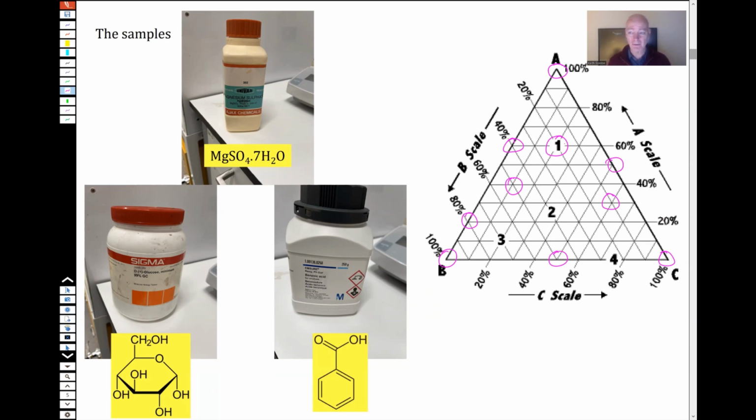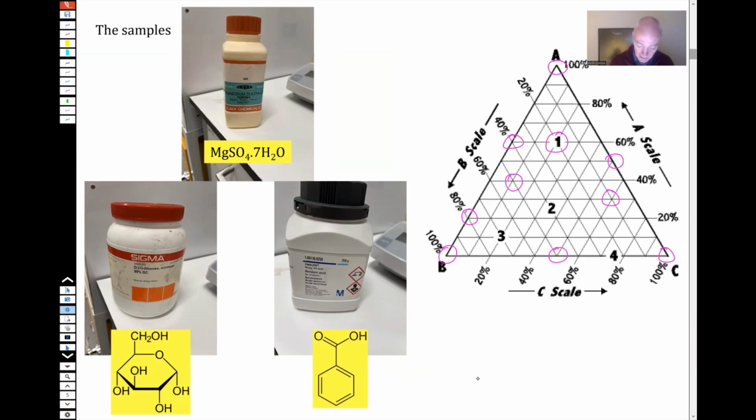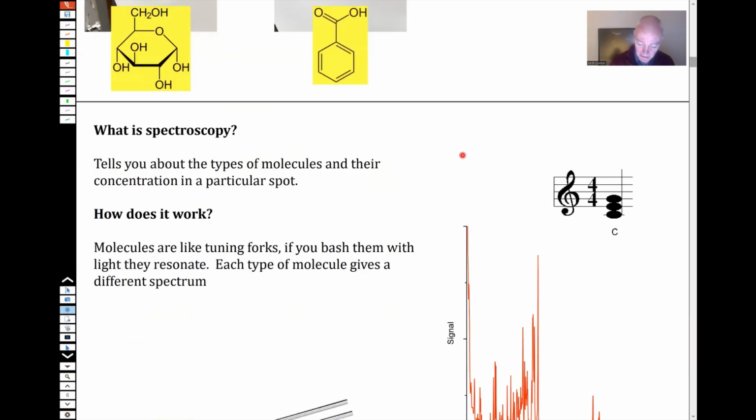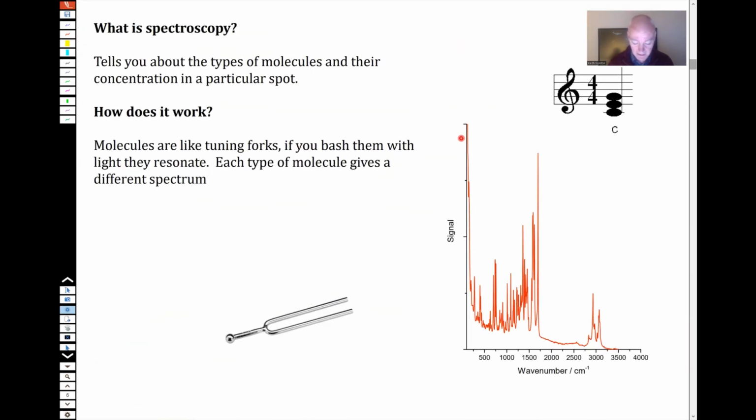And it's really critically important to understand, when you're mixing materials together, how much you've used, how much you've put in, and how well mixed they are. This is a really important thing to be able to do. And indeed, much of this experiment will test how well you mix things rather than much else. And it turns out mixing powder is not so straightforward. I think there's a very nice video about that given to you by Gervais. So those are the sorts of things that the experiment's about. I'm really not going to focus any more on that. I've mentioned it, and that's the last time I'll mention it.